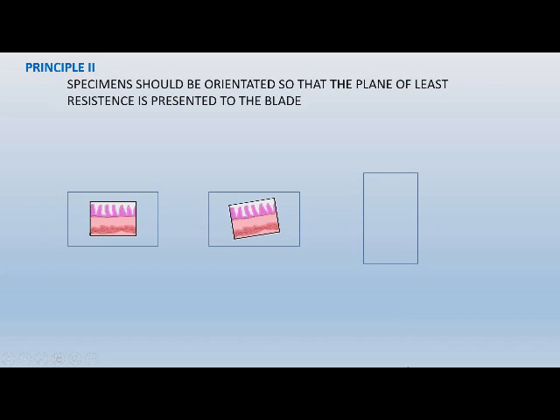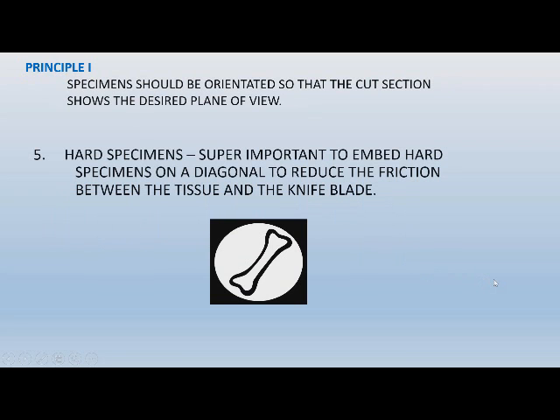with least resistance. And you might think, what does this mean to my microtome? When your microtome is cutting, it feels those things, and oftentimes you get chatter, you get Venetian blinding, because it just can't handle the tension between the block and the blade. And of course there are other reasons too, which we'll touch on a little bit. Now, you're probably saying to yourself, I would just simply flip it up vertically, cut it from this end, and get only half of the width. But for right now, I'm just going to put a big X on that, and we're going to come back to that in a slide a little bit later.